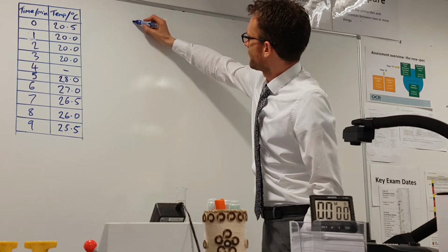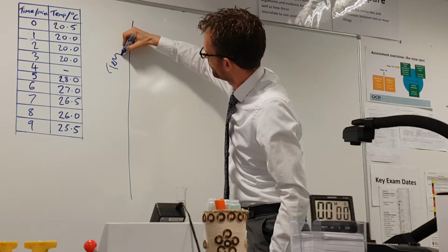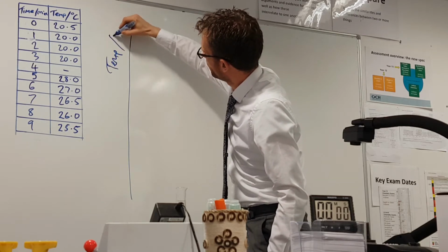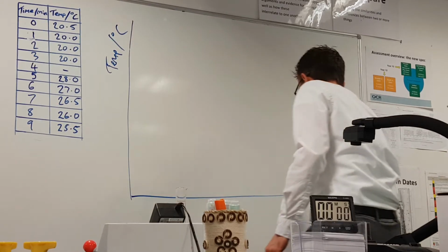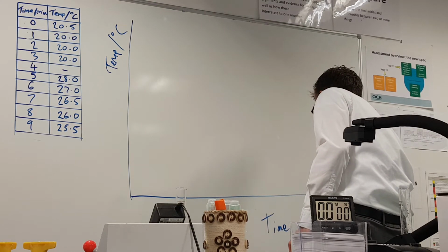The y-axis is temperature, and the x-axis is time. We're going to use minutes. Okay.